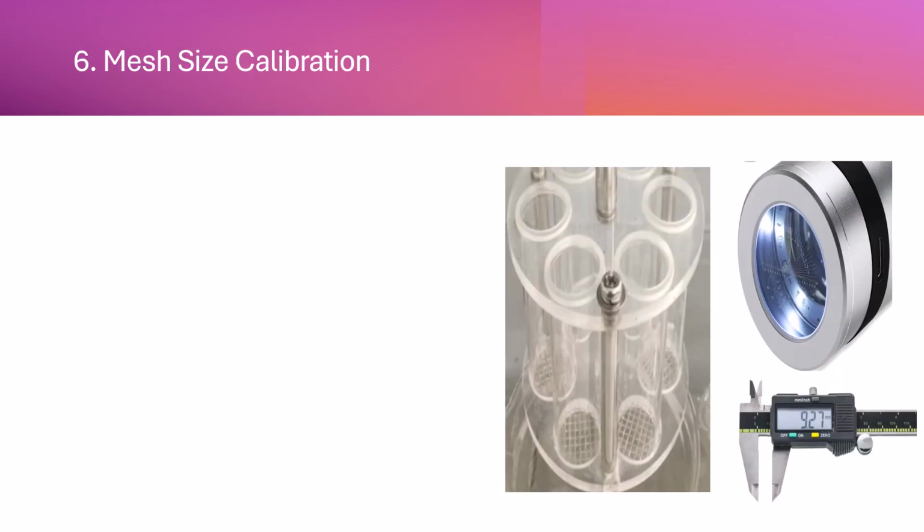So next is the mesh size calibration. The purpose of this mesh size calibration is to verify the sieve wire spacing, which ensures the aperture size complies with the specification for accurate disintegration testing. Now next is the procedure.